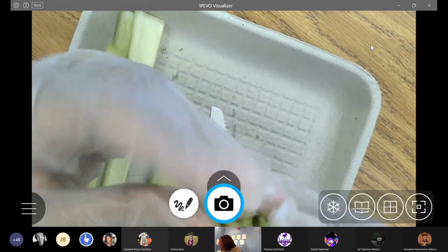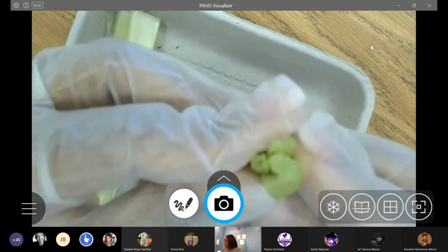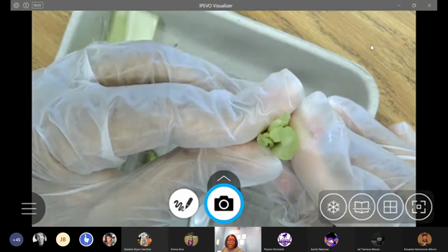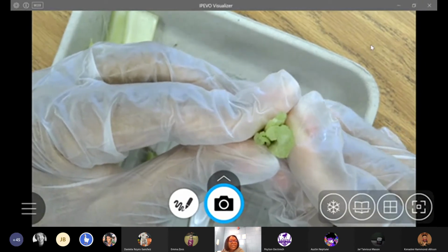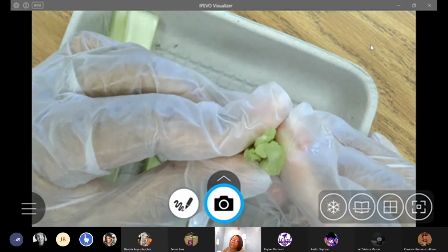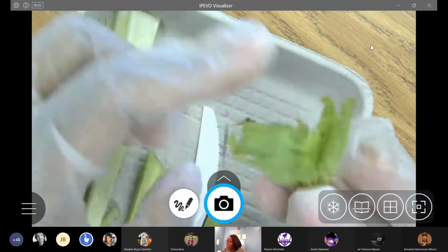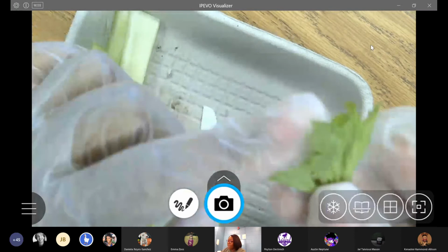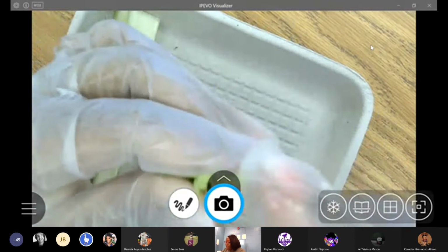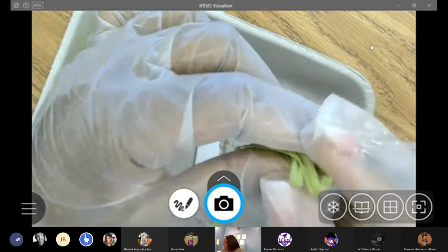Some of the leaves came off, but that's all right. Let's let that focus up. And what you're going to find here is you don't see many of those dark green dots. You see a lot of white flesh. There's a reason for that, babies. The reason why is because food is created in plants through photosynthesis. Food is made in the leaves, okay? So the leaves are going to have a lot more of the phloem highways where sugar is carried than xylem.